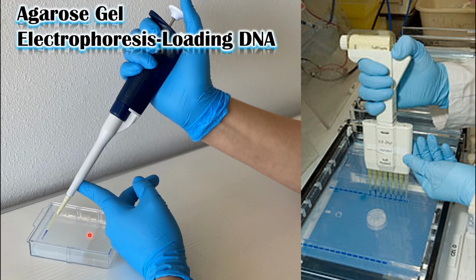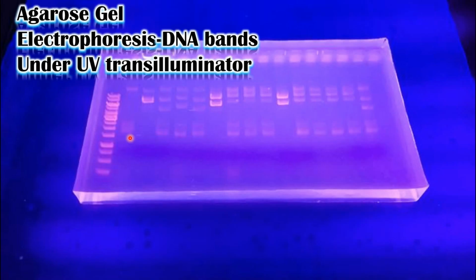The most crucial thing in electrophoresis is loading DNA. You have to load DNA into the well carefully without smudging. You can have an equipment where you can load multiple sets of DNA samples simultaneously, or you can use micropipette and load each DNA sample into the well specifically, carefully, without smudging. The gel in which the DNA samples have run is placed under transilluminator, UV transilluminator, and you can see the fluorescent DNA fragments in the form of bands. So these are the bands that appear under transilluminator as fluorescent bands.